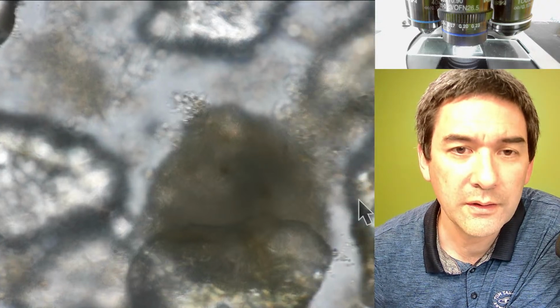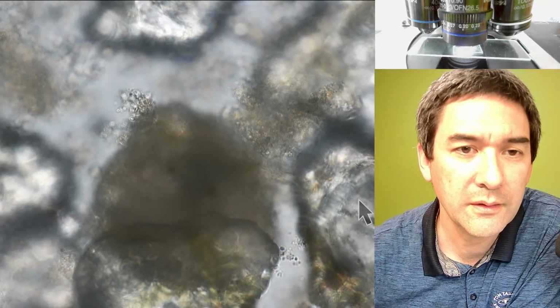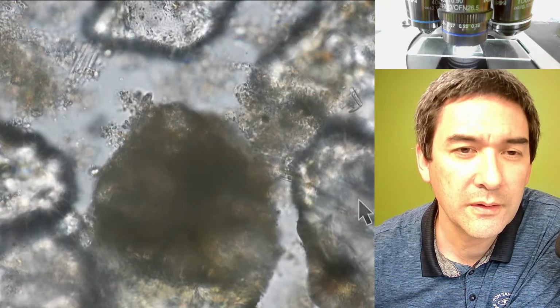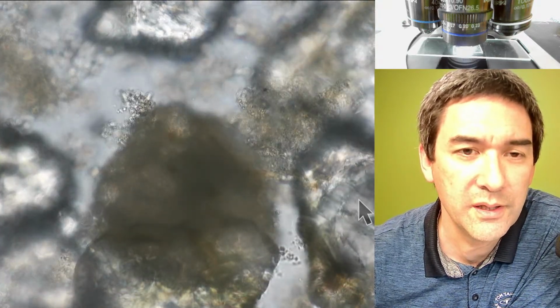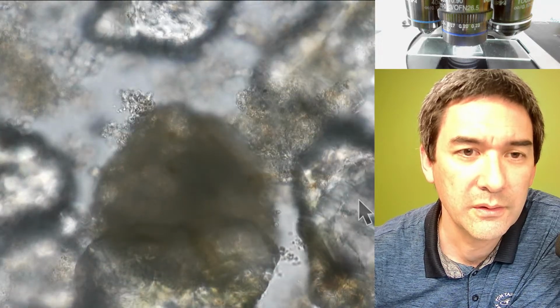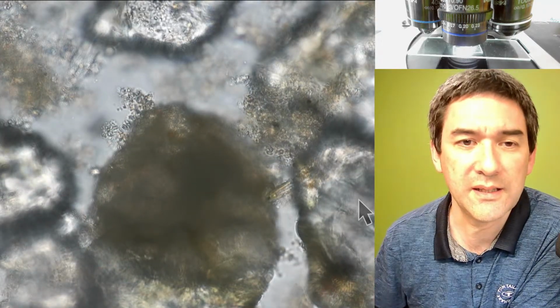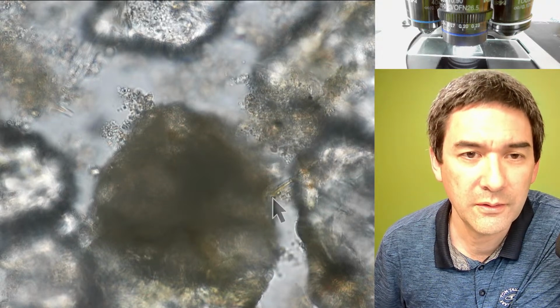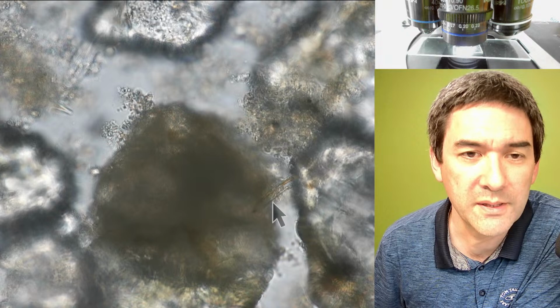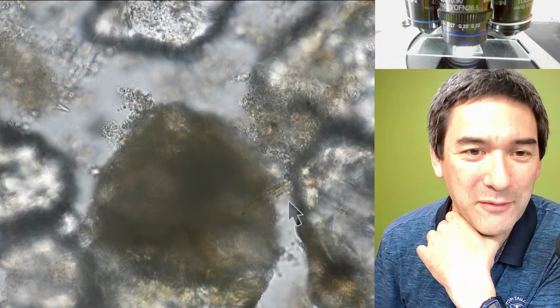It's difficult to see a little bit, because it's covered in all of this slimy material, I don't know what it is. Yes, that's a diatom and it's alive. Here it is. Okay, I guess I have to correct myself here. Some of them were able to survive.